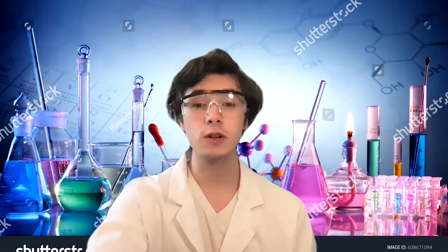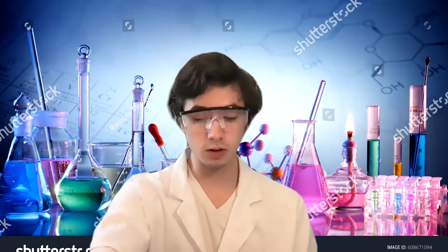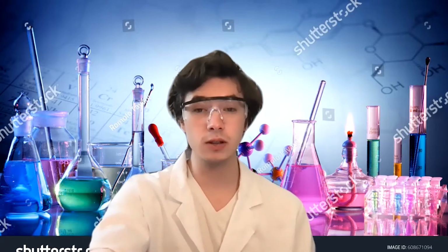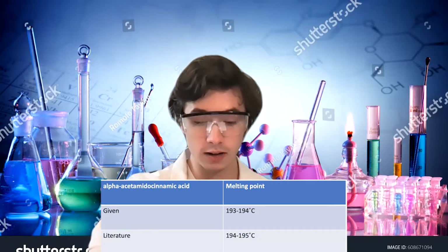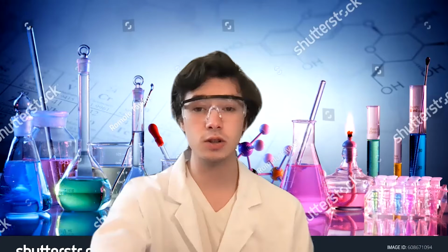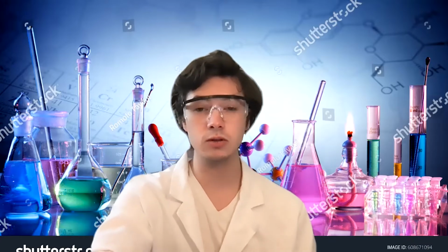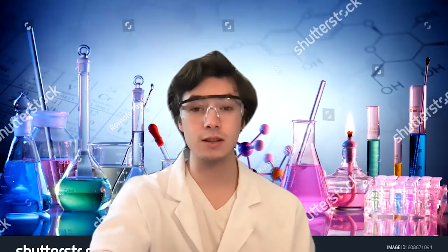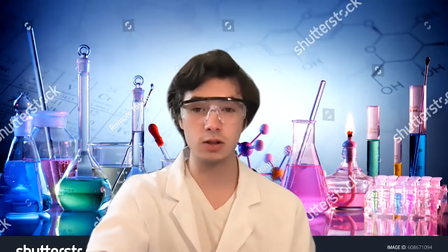Researching this chemical more, I looked at a website called chemicalbook.com and found the melting point for this compound, which was stated at 194 to 195 degrees Celsius, so only 1 degree off from the stated temperature of the melting point. So with the information that was given to me and the information I found, I was able to say that this was in fact the product that came out of this reaction that we were supposed to look at.